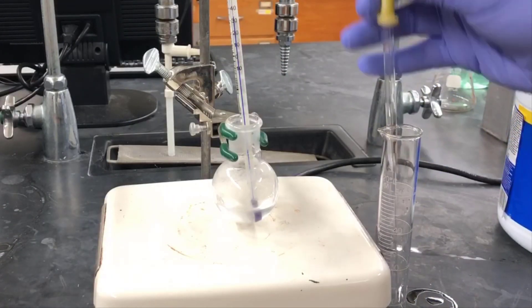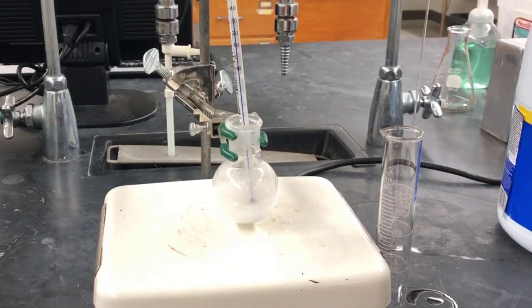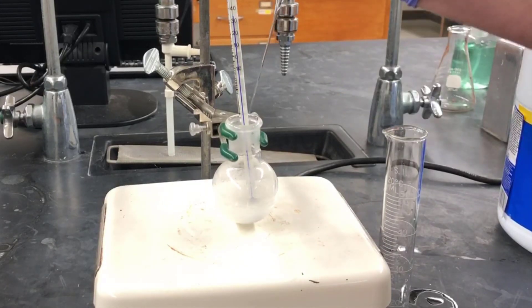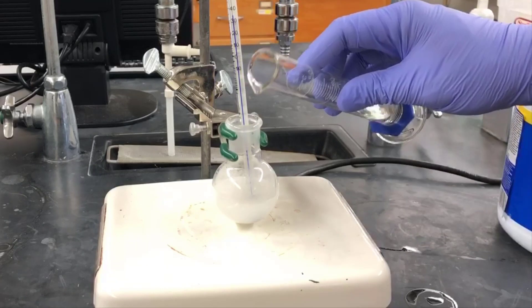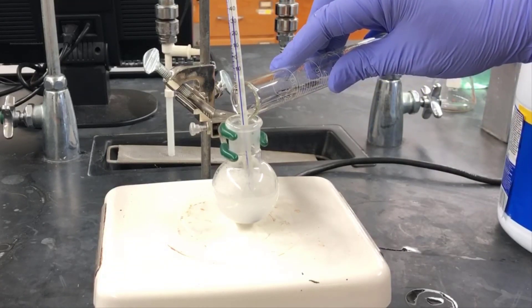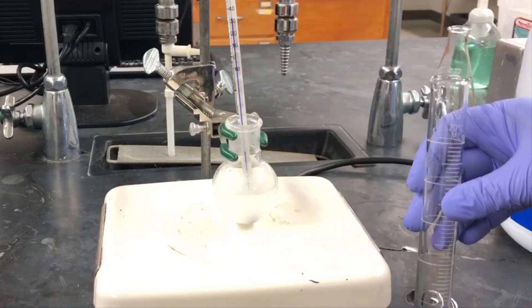When you notice the temperature is starting to drop, you can add the bleach more quickly. Here I'm adding pipettefuls at a time, and the temperature isn't really rising. The reaction is going quite slowly now, and it's okay to pour in the rest of the bleach solution. You can see the temperature has remained below 40 degrees the whole time.